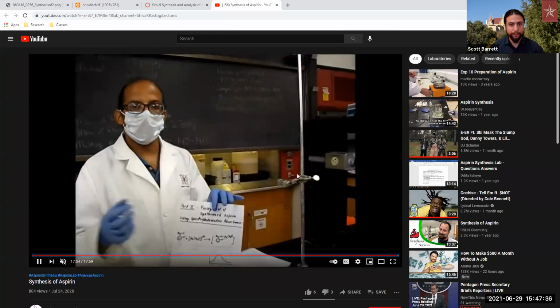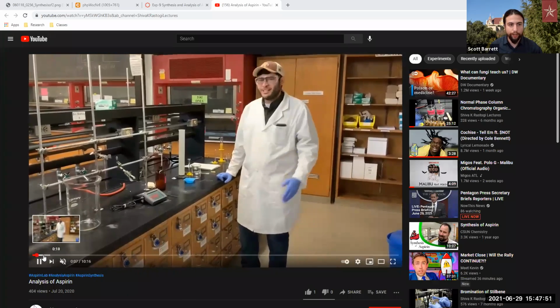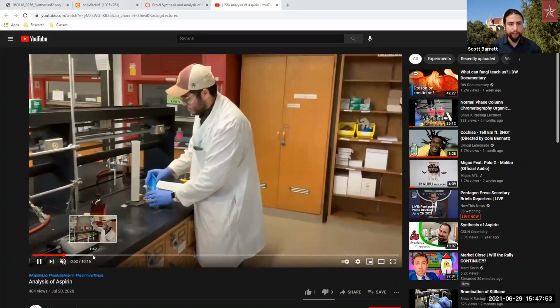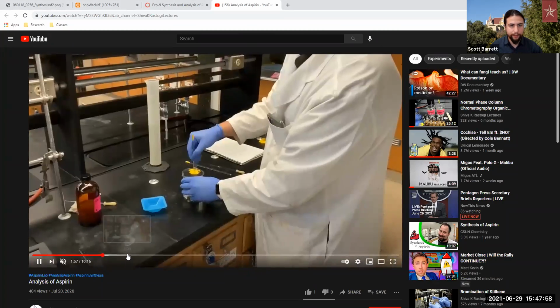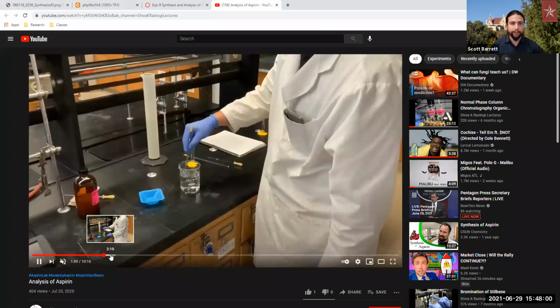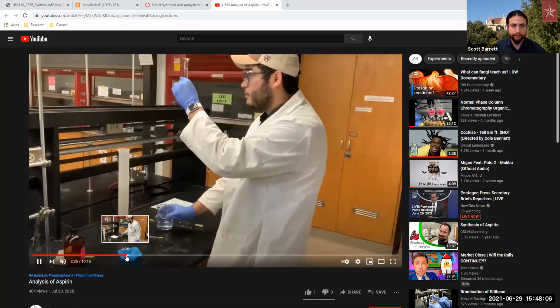So going forward, it looks like they didn't have that. Let me just come over here for one moment and see if they possibly have the spectrophotometer. Okay, according to this, they do. For review, of course, you can watch through the full video, but we're going to just jump across. We've taken our product, and then we're dissolving it down and going to prepare our iron solution. Let me skip ahead because a lot of it is stirring.